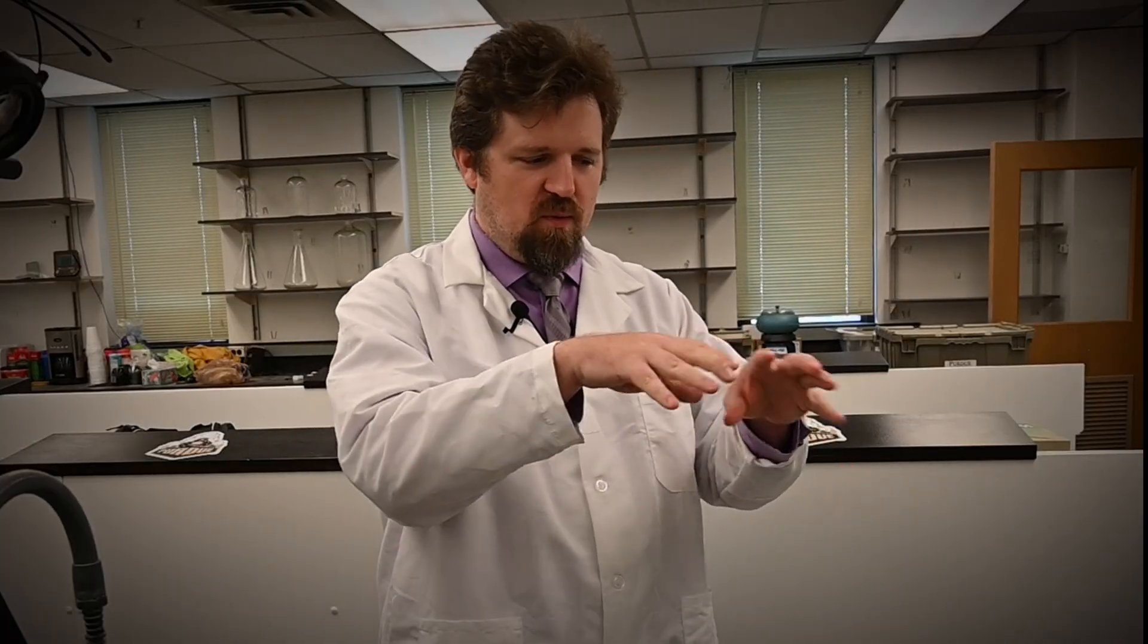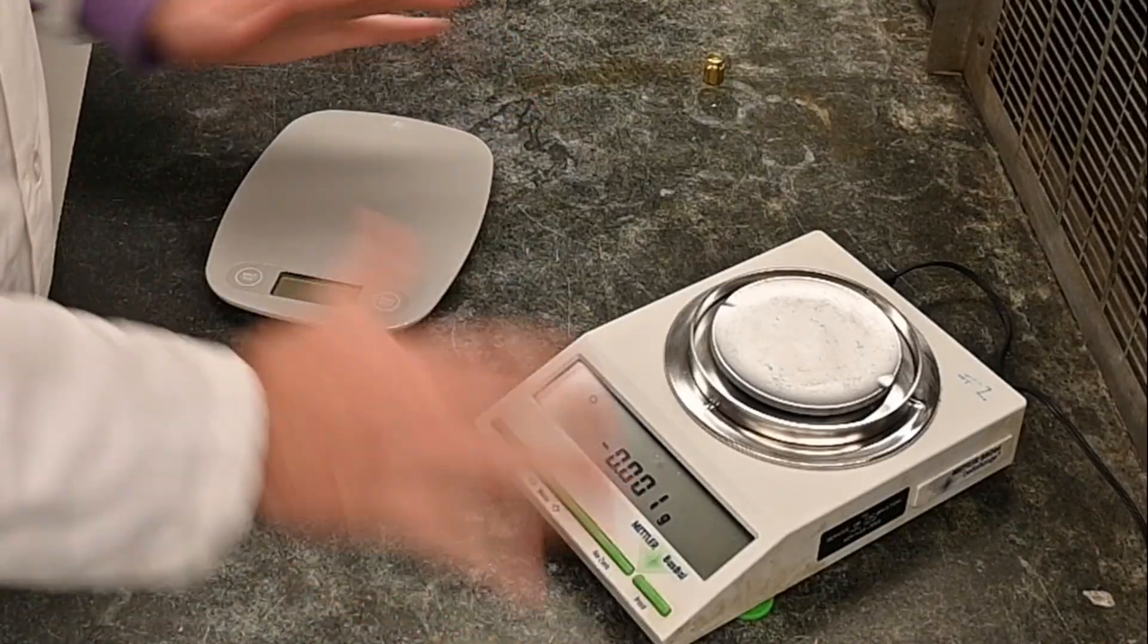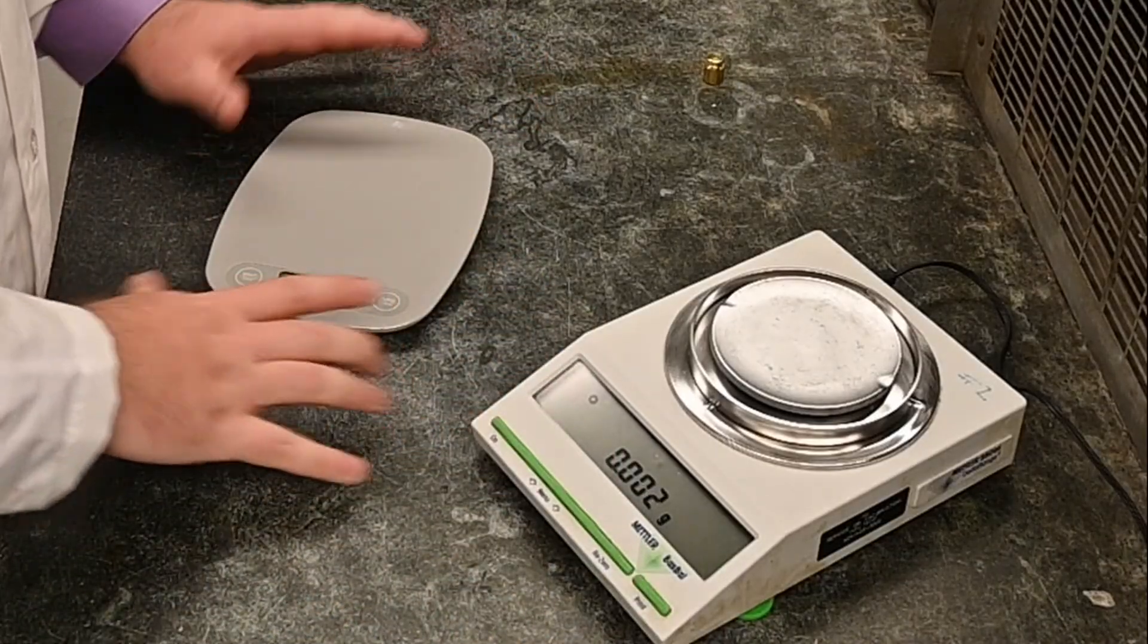What they do, like everything else we talked about, is try to measure something's mass and they're way easier to use and they have a lot more flexibility in how you use them. So if you take a look here, we have two various sets of precision.